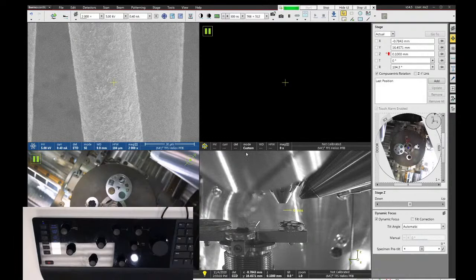and I want to tell the microscope to use that as my reference for the Z-axis. When you start off on the FEI software, the Z-axis will show that you're at 0 millimeters, and it shows that the positive direction is up. Once I get in focus, I will push this link Z to FWD button up here in the toolbar, and that will couple whatever this number happens to be over here to the Z-axis. So I'm going to push that, and it will change from this little red question mark icon to an up and down arrow. And the 9.8 millimeters in the data bar has now gone over here to the Z coordinate. And the positive direction for Z is now down.